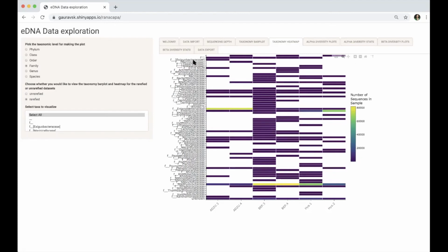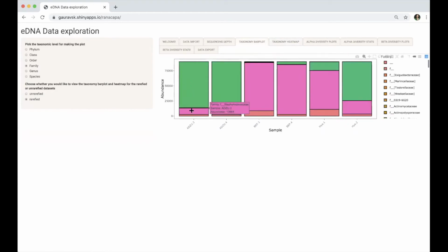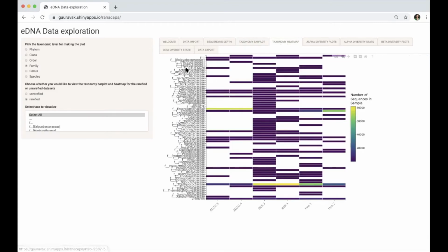This is nice because you see there actually was a lot of different bacteria in our samples. It wasn't just 2 or 3, like what we could see in the bar plot. We're only really seeing 2 or 3 main colors, and so it makes you think, oh, there's only 3 types of bacteria here at the family level. But actually there's a lot more. They're just all very, very lowly abundant. There's only a few sequences of each of these different families. So they're a little bit more hidden in the other plot, but essentially it's showing the same information.